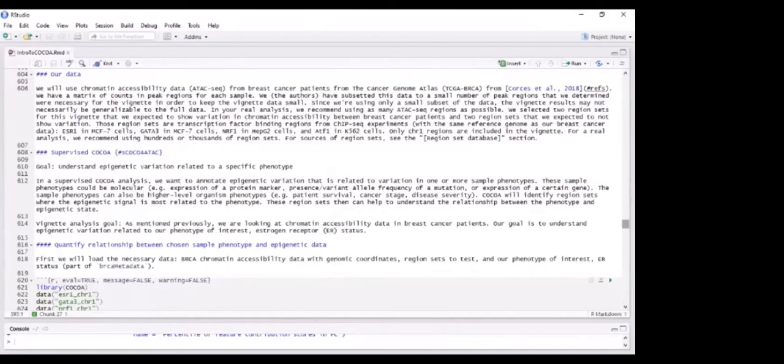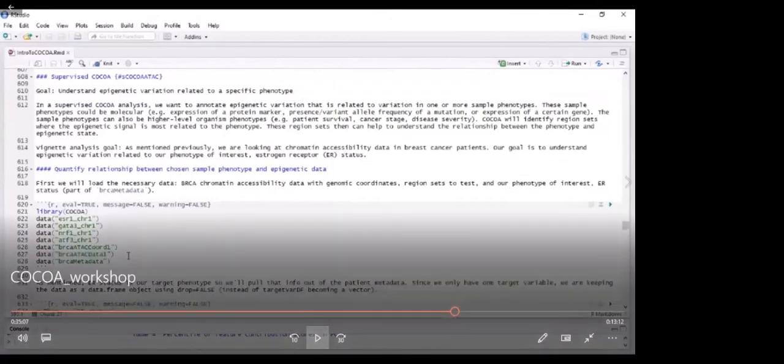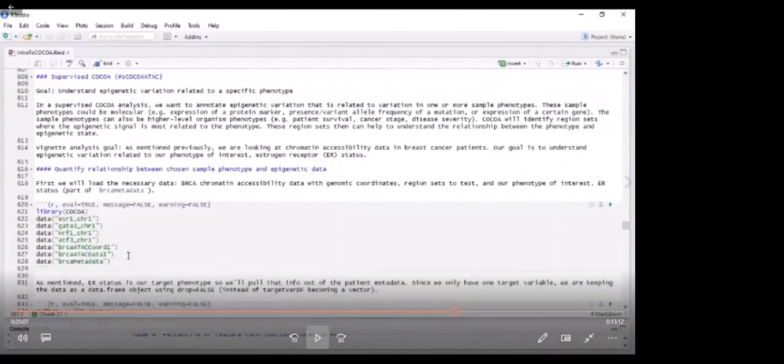John, can we make a quick break and answer a question that had to do with the last heat map? There was a question whether in that last heat map, the values for each row sum to 1 across the columns. They do not. Each column is calculated separately.